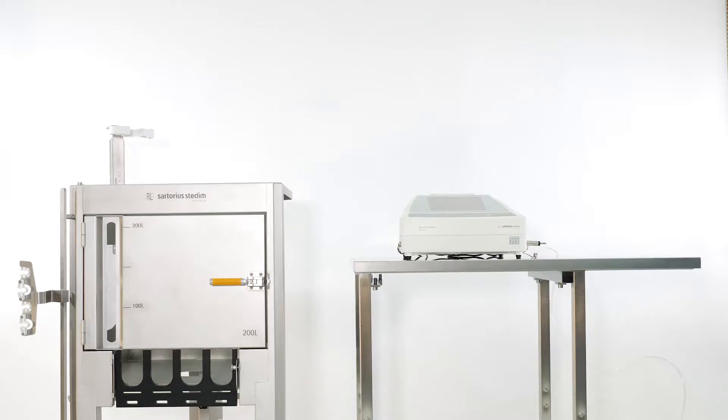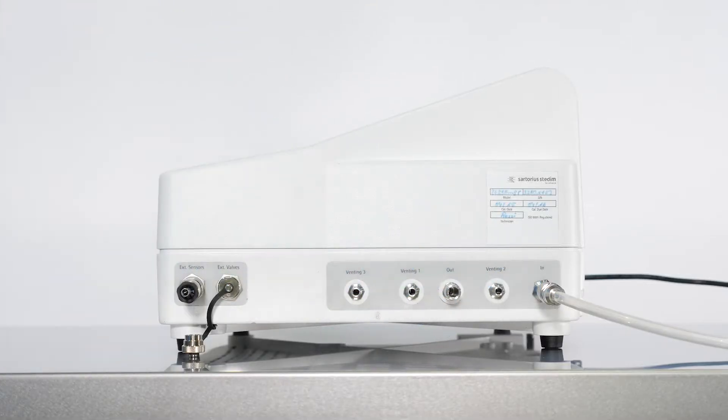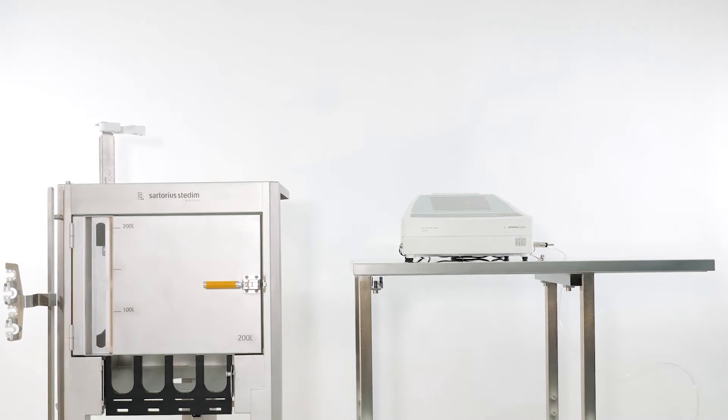Check that all connections are prepared: the external temperature sensor, the inlet port to the compressed air supply, and the main power plug. Ensure that the compressed air supply can provide at least 4.5 bar.